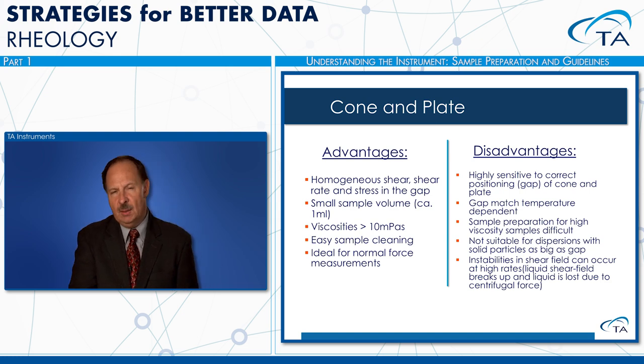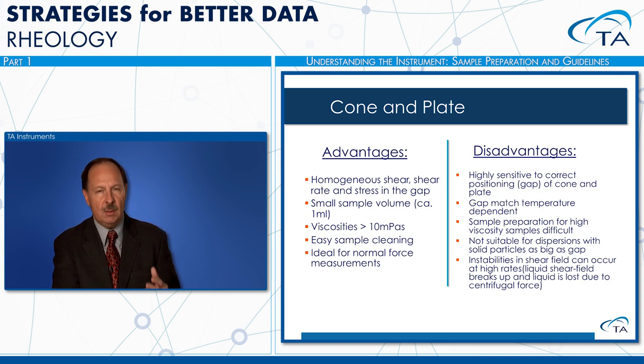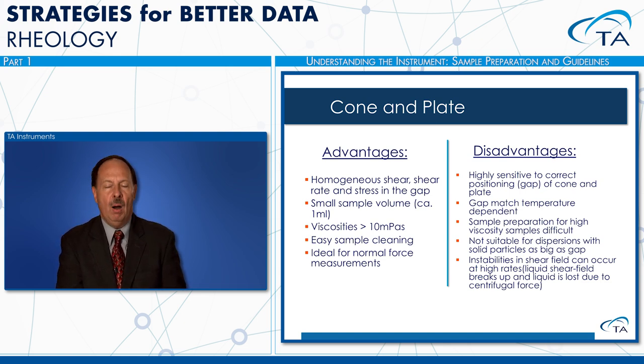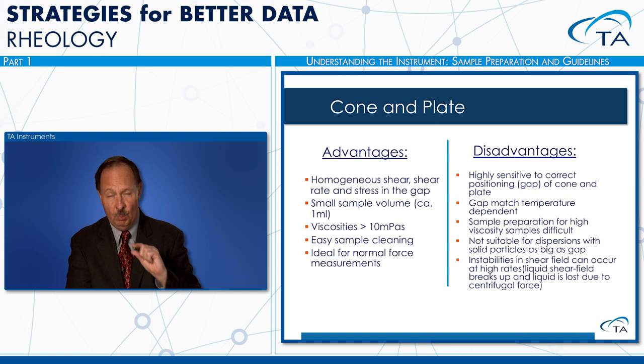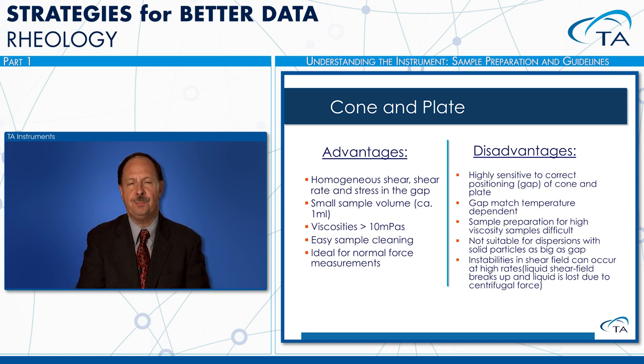Okay, so again, as is the case with every one of these geometries, there are advantages and there are disadvantages. And the nice thing about the cone and plate from a theoretical standpoint is that the shear rate and the shear stress are constant everywhere in that gap. Okay. Probably the main limitations are that you have to run at such a small gap, and that will preclude testing materials that have big particles or material that's somewhat high in molecular weight that generates an excessive normal force as you squeeze it down.